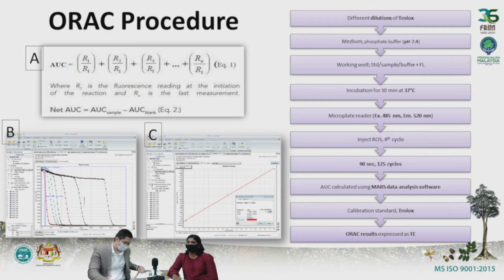In terms of the injection, just now you mentioned that if the microplate reader has an automated injector, it can actually do the automated injection of the radicals itself, so you don't have to manually pipette it to the plate. Yes. So obviously we all assume that automated injection will be better, but how much better is it actually?